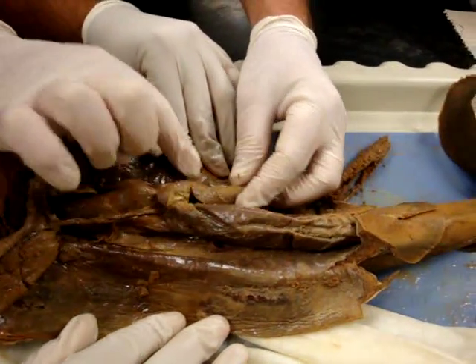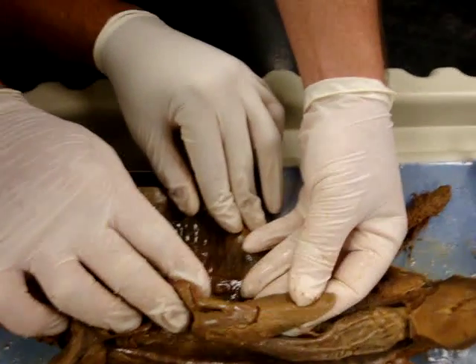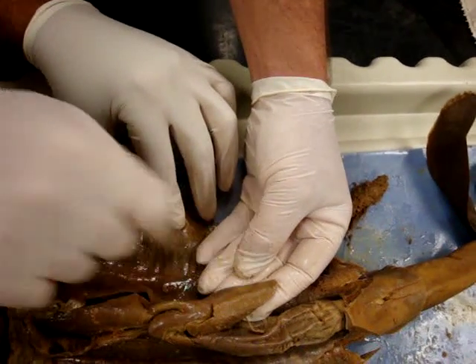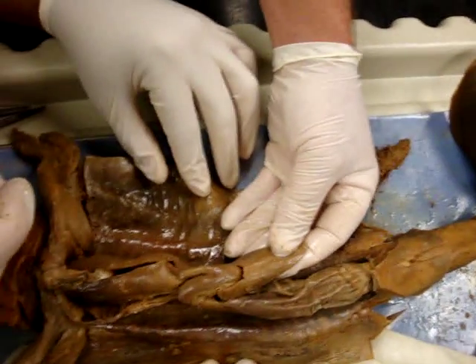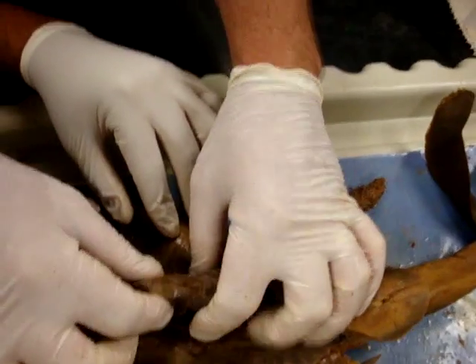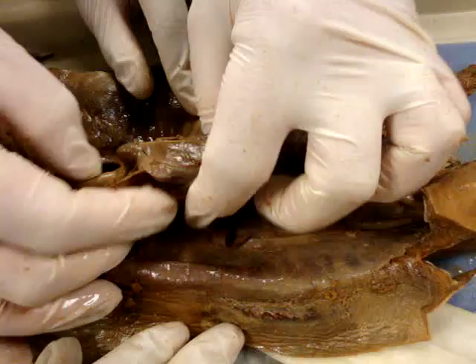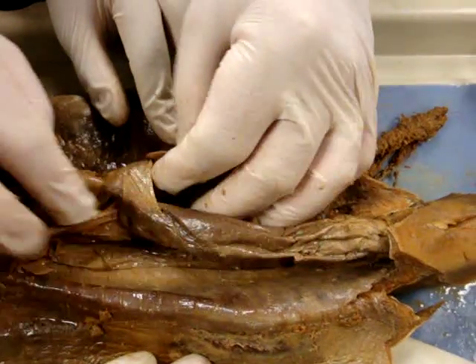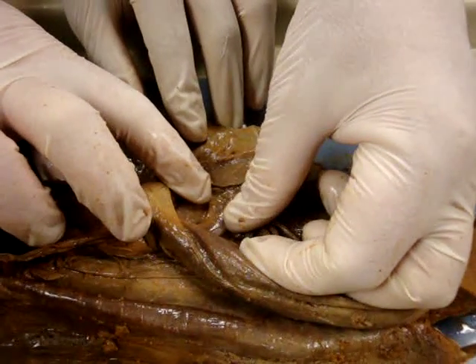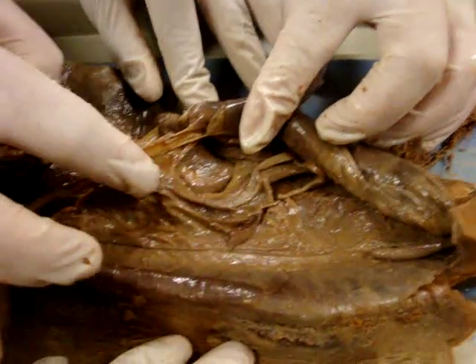Working our way around, we have the duodenum — it's kind of a Z-shaped structure. At the first corner of that Z-shaped structure, we have the spleen, which is always kind of arrowhead-shaped. And there are a couple of other accessory structures here. You can see the difference in color — that's a piece of the pancreas. And then we have another piece of the pancreas over here, and another piece of the pancreas here.